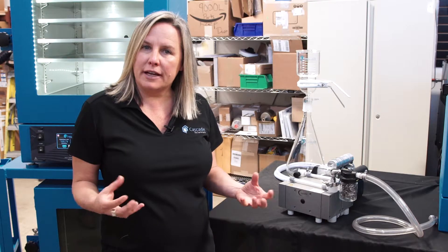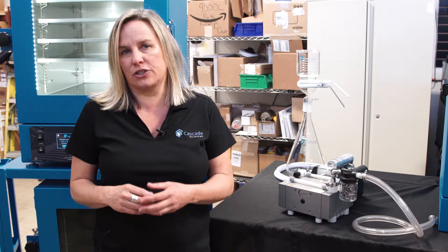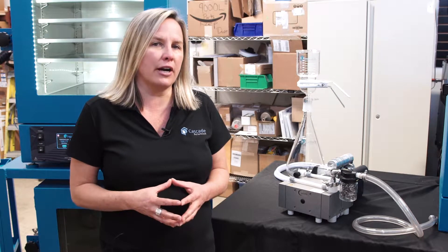It's a 2.3 CFM diaphragm pump with PTFE interior diaphragm, so it's solvent resistant. It's a real laboratory workhorse, very popular in laboratory environments.